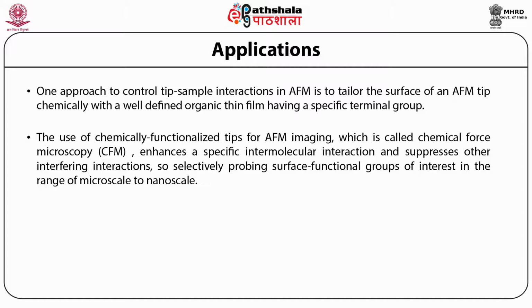Also, CFM makes it possible to measure a variety of non-covalent chemical and biological interaction forces directly as a function of tip-sample distance, which is based on the force measurement capability of AFM.